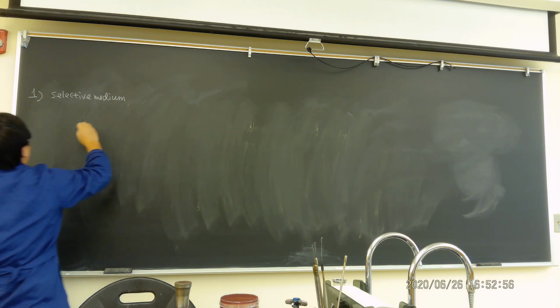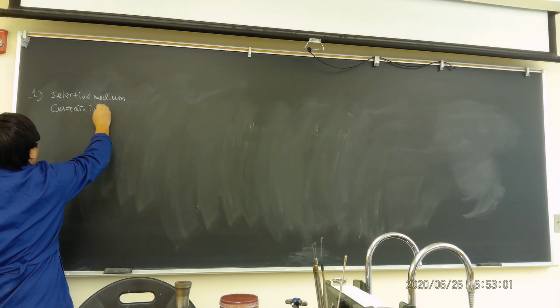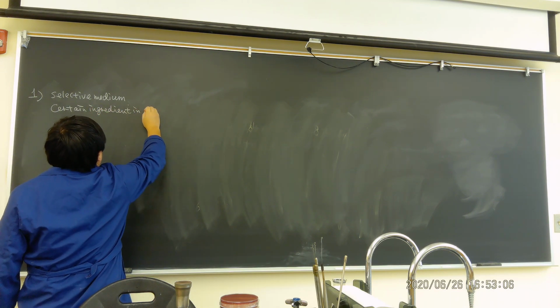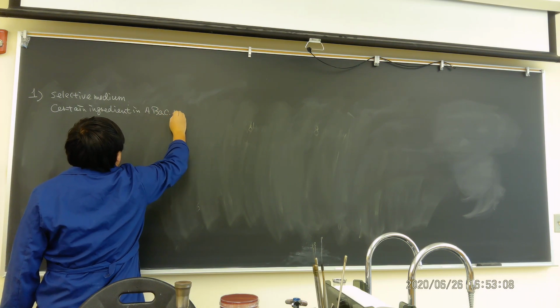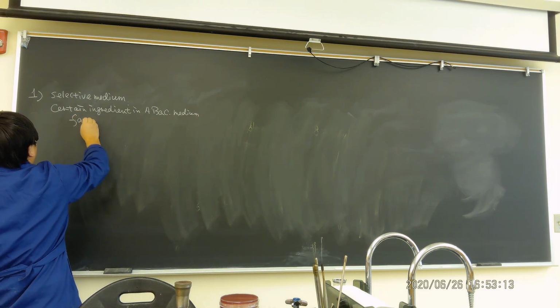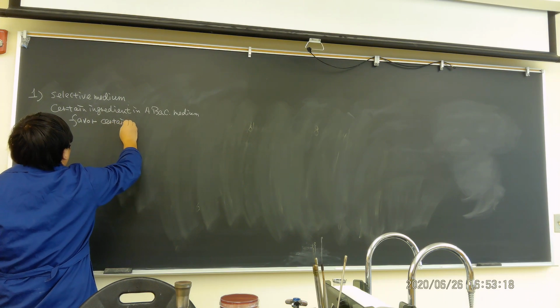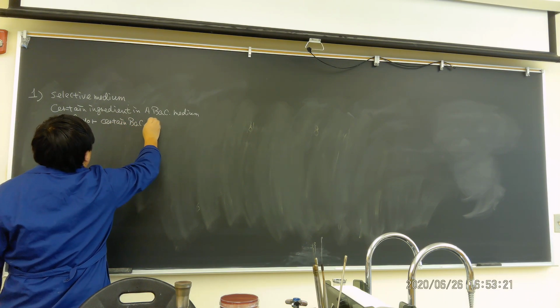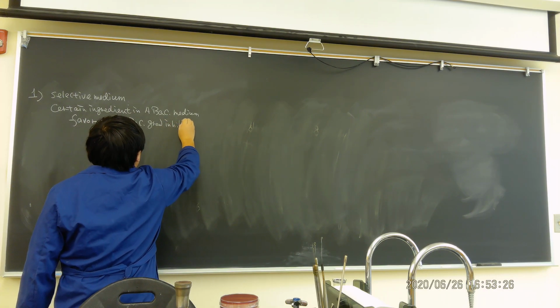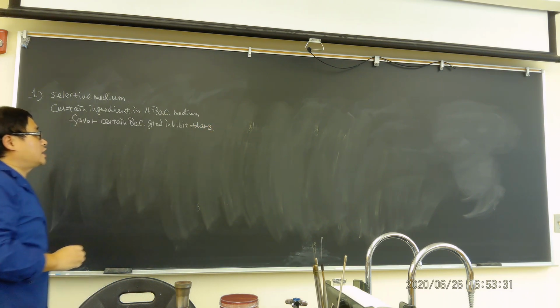Selective media means there is a certain ingredient in a bacterial medium which favors certain bacterial growth and inhibits others. And we will do some of them today.